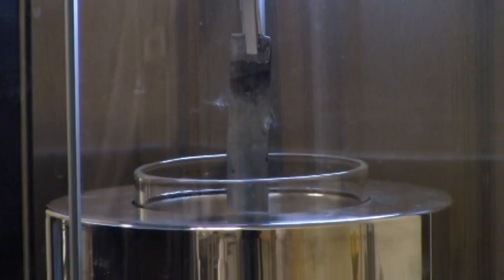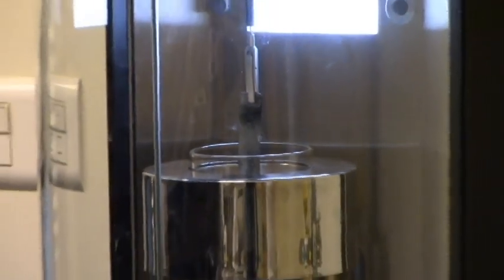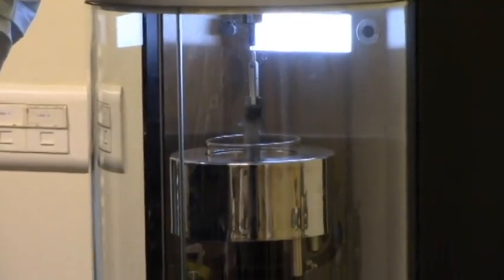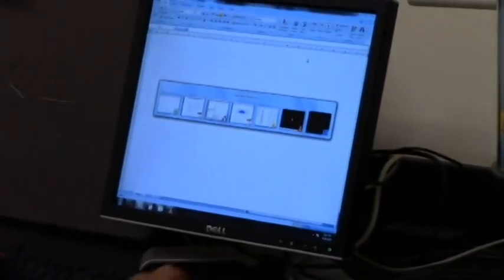Now, we'll push it up as before to make it almost at the surface of the heptane. And then go here. I can lift this off now. We'll close the contact angle part.